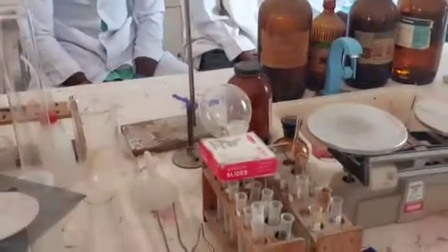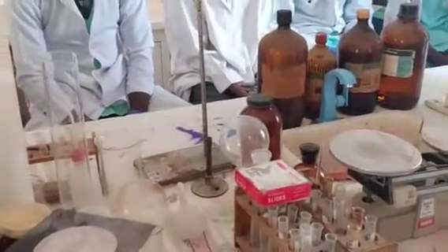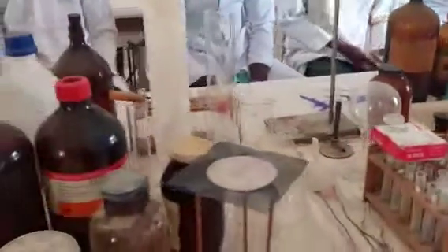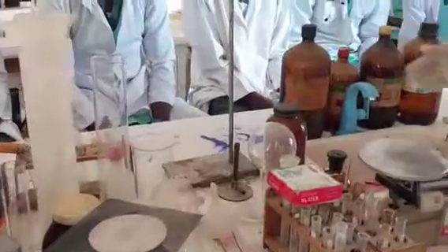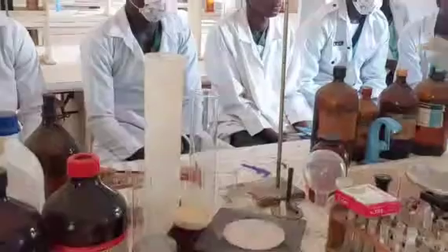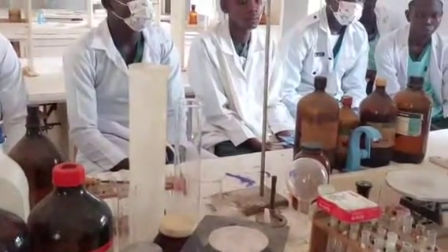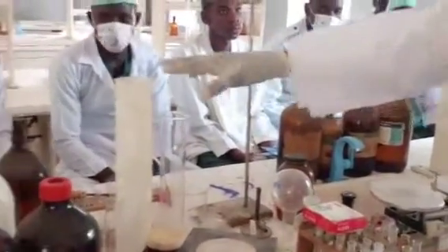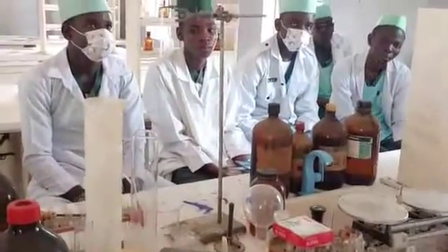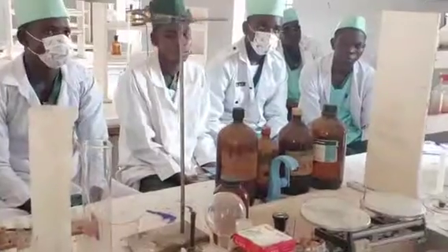So I think with this introduction, let me add more to this. I'm expecting that some of you will ask why these are stored this way. We have two types of bottles actually: the amber bottle and the transparent bottle. Look at this. All these liquid reagents are stored in amber bottles. Why?